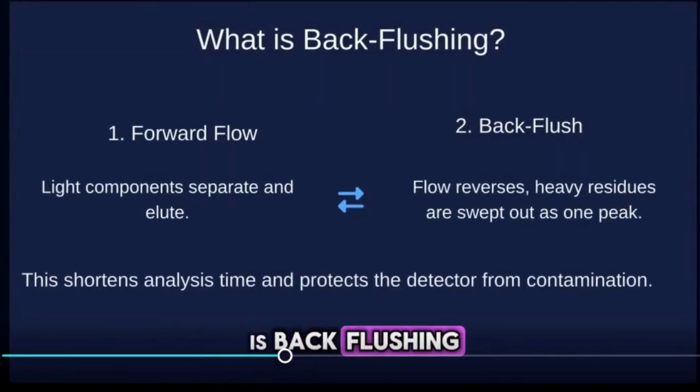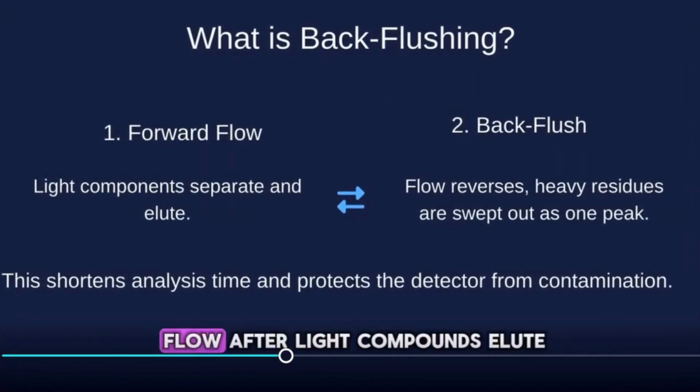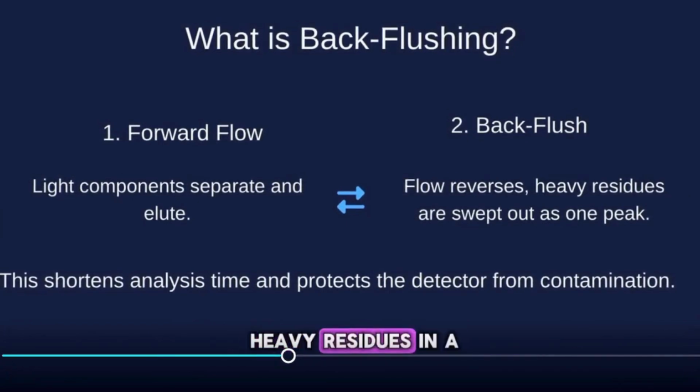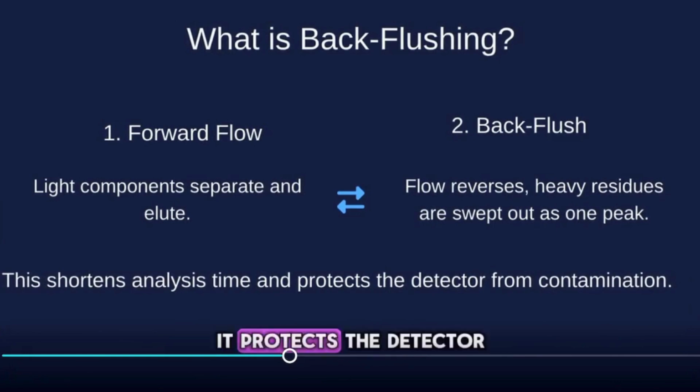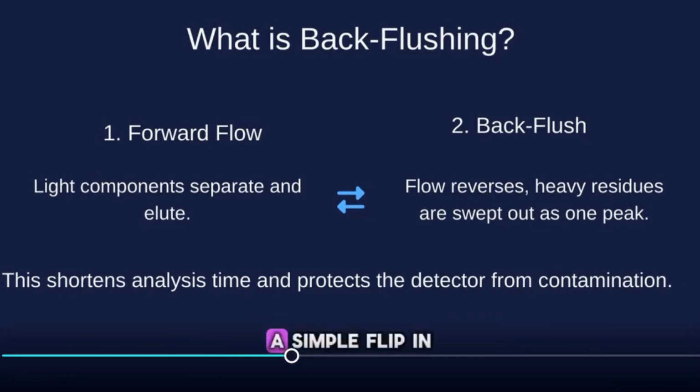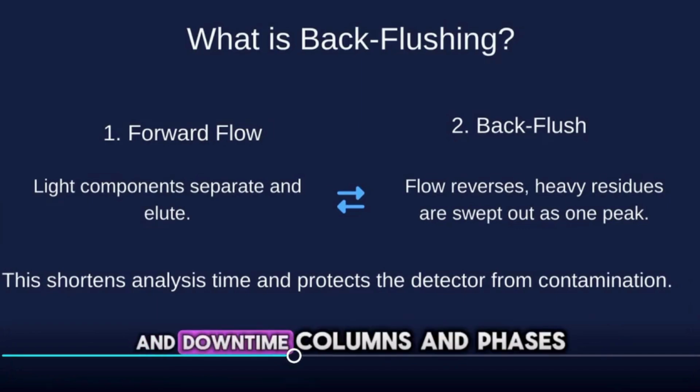What is backflushing? Backflushing reverses the flow after light compounds elute. This helps sweep out heavy residues in a single step. It protects the detector and shortens analysis time significantly. A simple flip in flow direction can save hours of cleaning and downtime.